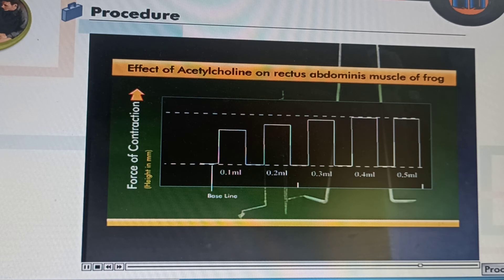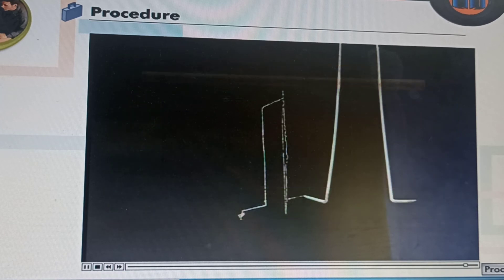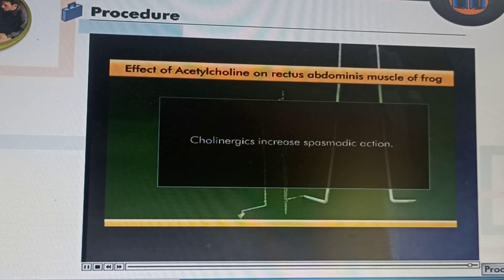Measure the height of each response in millimeters. Height of response is indicative of muscle contraction. You can see that with increasing doses of acetylcholine, muscle contraction increases. Hence, we can say that cholinergic action increases spasmodic action.